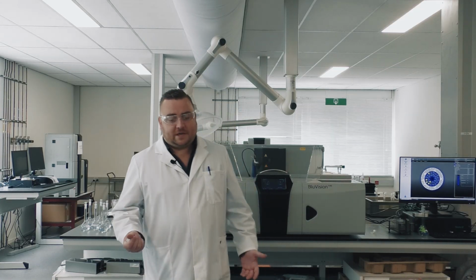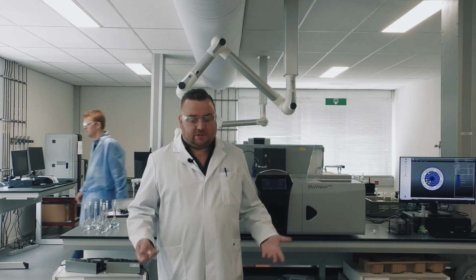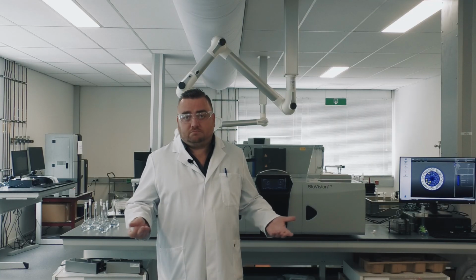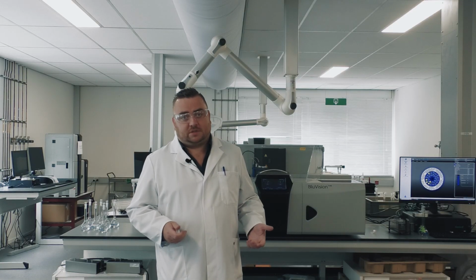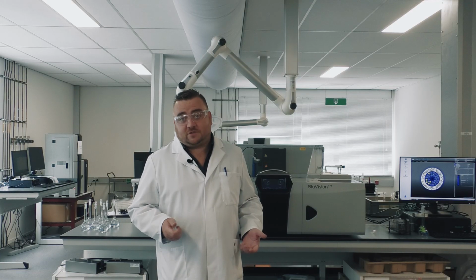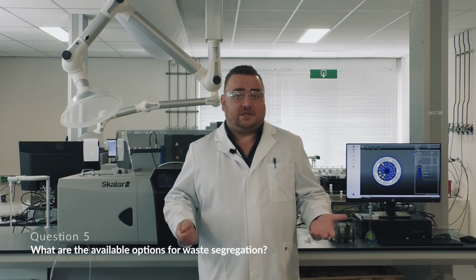And also the fact that they are disposable eliminates any possibility of poor results coming from the contamination of previously used cuvettes or scratched or otherwise damaged cuvettes. And that really does contribute to these low MDLs, as I've just mentioned. Which brings us nicely to question number 5. What are the options for being able to segregate waste?